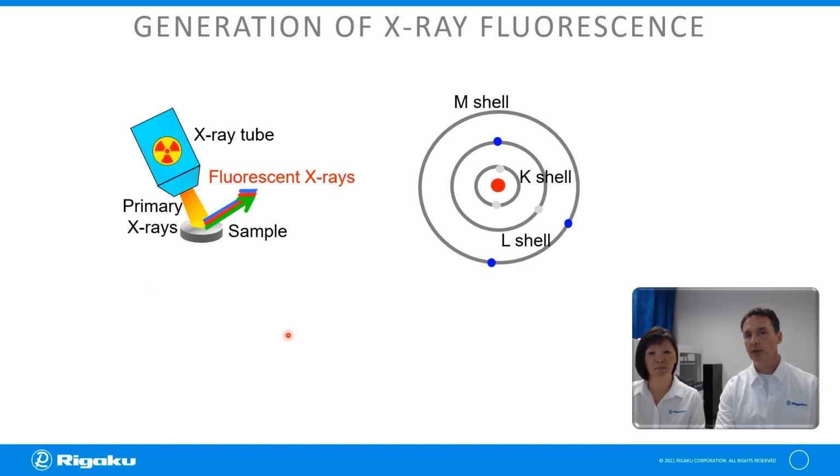Okay, so just to give a little background on the X-ray fluorescence, I'm not going to spend a lot of time on that. In fact, if you join us again at 2:30 Central Time for our workshop, we're going to spend maybe about half an hour talking about that. We have a whole 90-minute session, but we're going to devote a little bit more time so you can really understand what's going on with fluorescence and why it's a benefit.